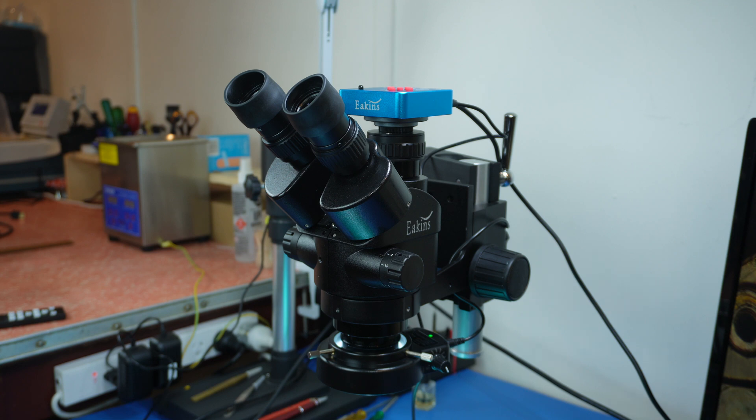So this turned up in a great big carton. It was just under a thousand Australian dollars, and basically half the cost was shipping getting it here to Australia. So yes, the microscope itself was very reasonably priced, but it had the wrong manual in it. The manual was for another microscope, so I had to work things out just by looking at pictures on the seller's website as to how it was supposed to go together.